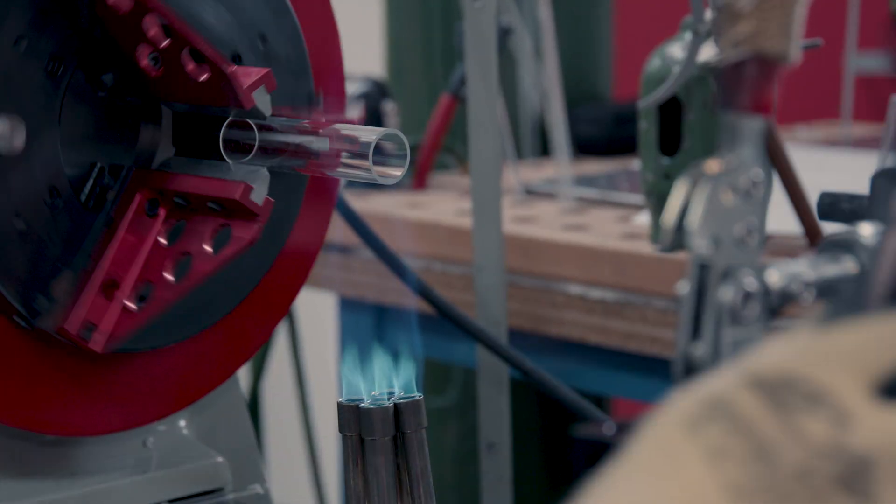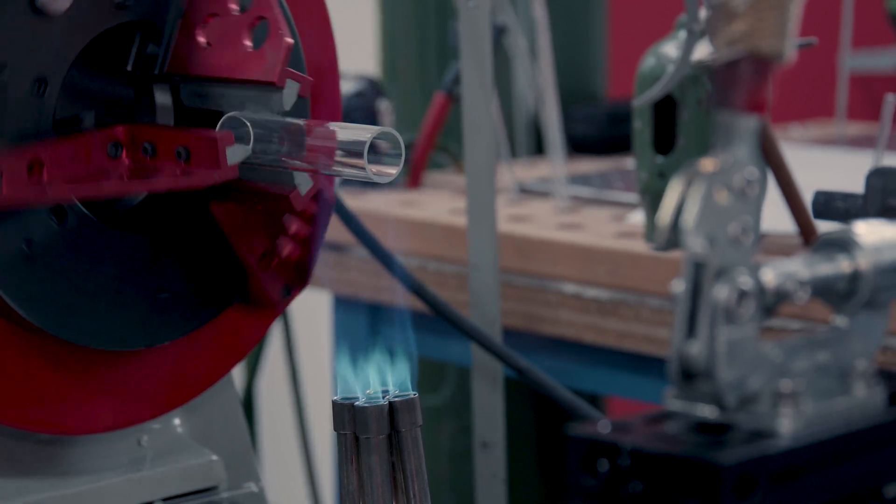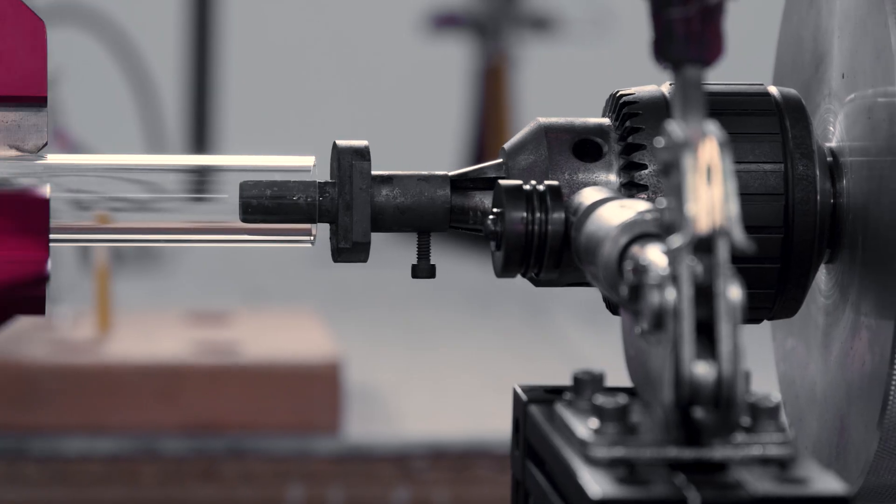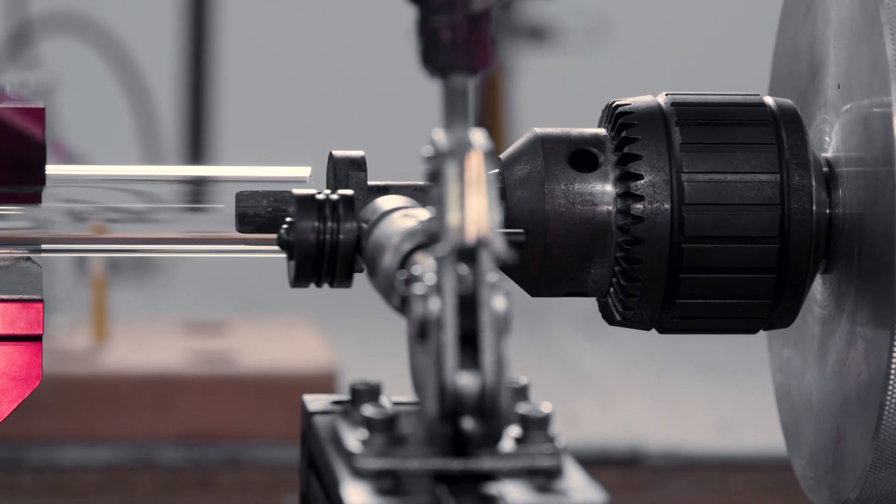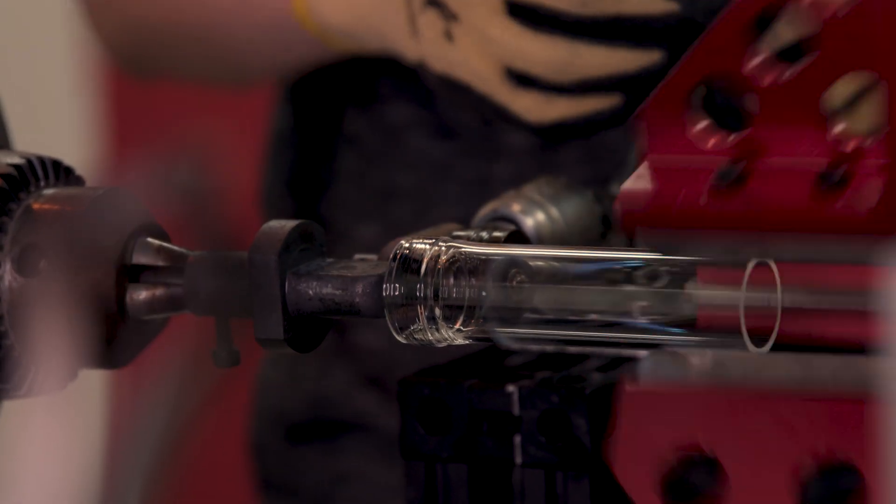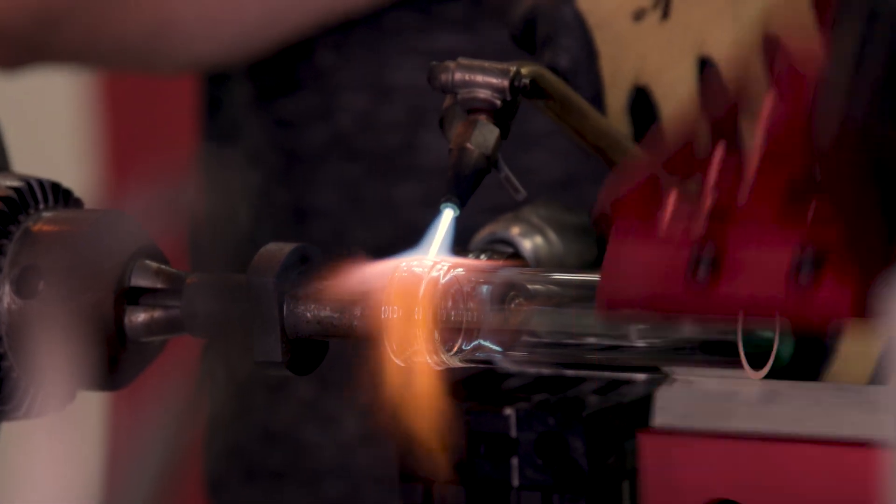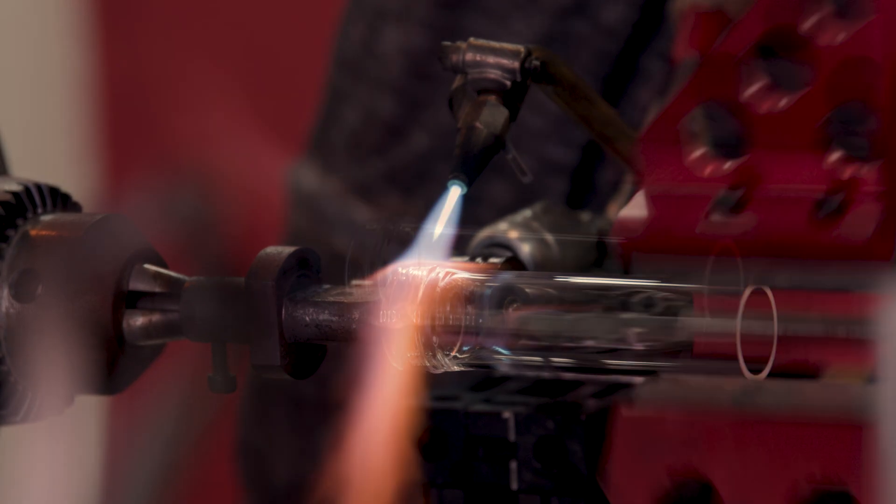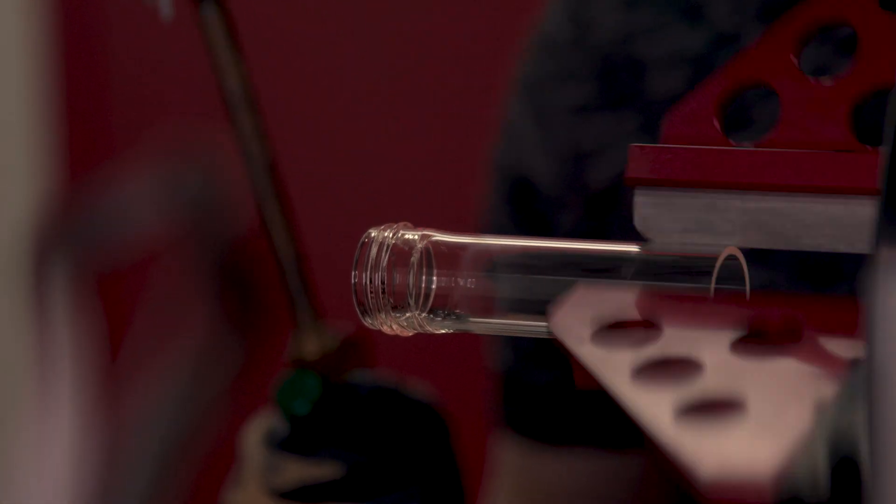We do get a lot of special orders, and they're usually pretty interesting to work on. It's definitely unique that Thor Labs was willing to reach out and get an internal glassblowing operation in the company. There's not many big companies out there that have glass divisions focused on custom glass work and making parts for the customers that they want that aren't out there.